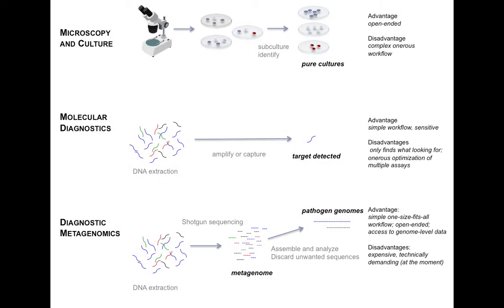But as I say, 16S, you see there's a lot of literature out there, but it's not something that we particularly in my group are interested in doing much more in the future. What we're interested in doing is saying, well, actually, can we move beyond these kind of molecular diagnostic approaches where you amplify or capture things and actually go towards what we might call diagnostic metagenomics?